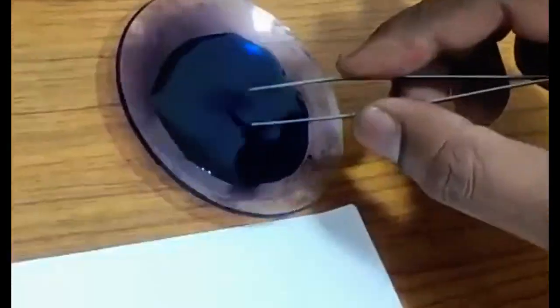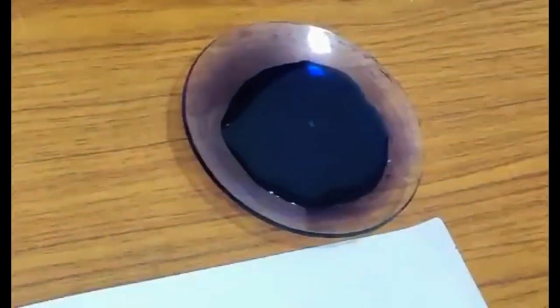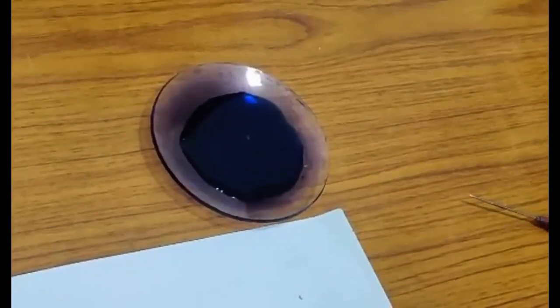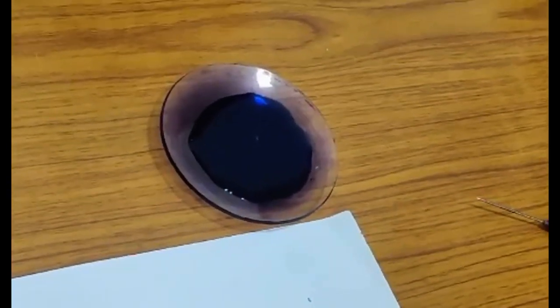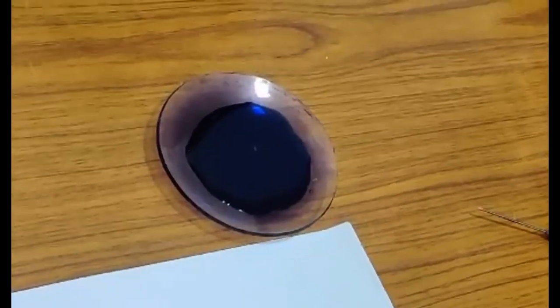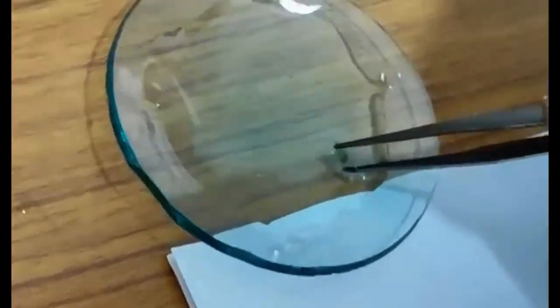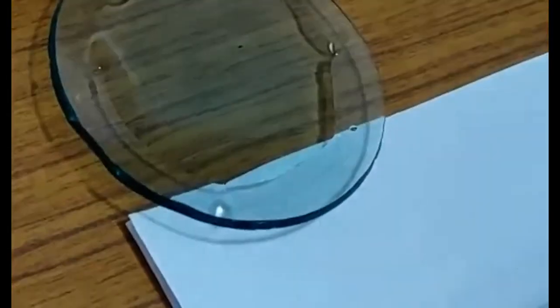So we have taken one peel of the leaf of another plant, and the peel is under treatment with toluidine blue, a blue color stain. We will keep it in the stain for at least 2 to 3 minutes, so that the peel with the trichomes, the hair-like structures on the surface of the plant body, can be stained and observed under the microscope. The sample is treated with the toluidine blue stain, and the extra stain is washed away with the help of distilled water.